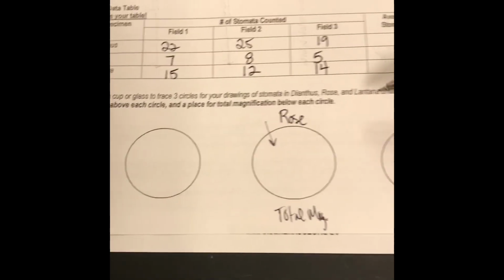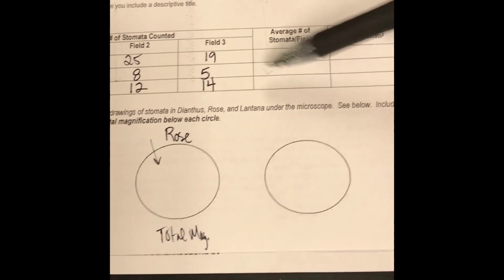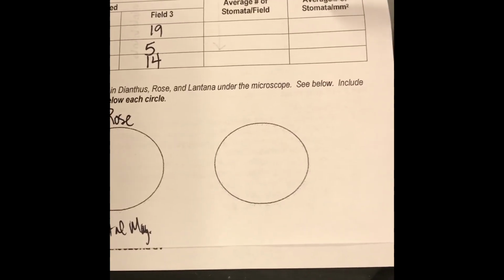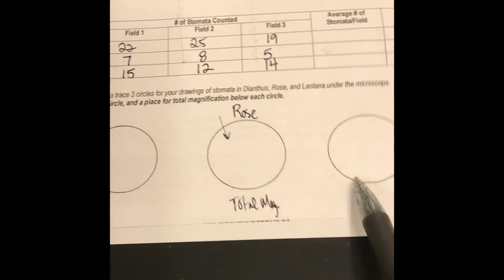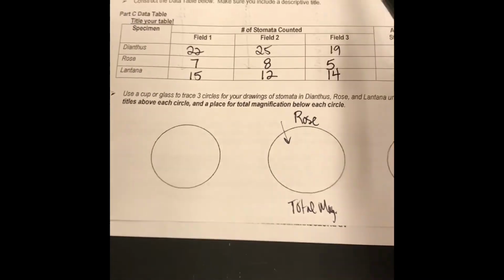So what you need to do now, okay, you're going to take all 3 of these. You need to calculate the average number in all 3 fields, and then use the lab data sheet, the directions, and calculate the average number per millimeter squared. And then in your lab book, you're going to have a picture for each of the 3 leaves. Don't forget your title and your total magnification below that.